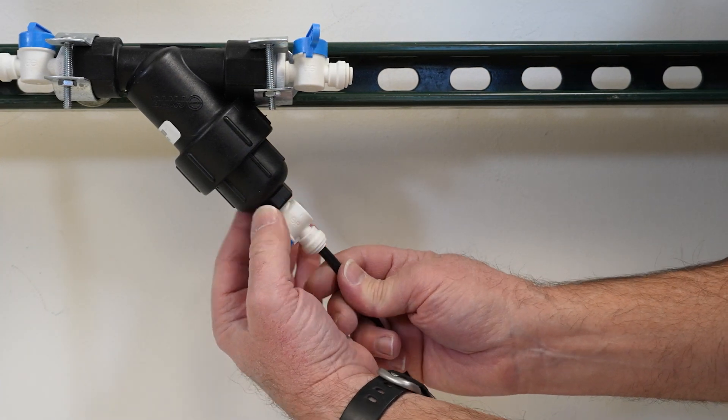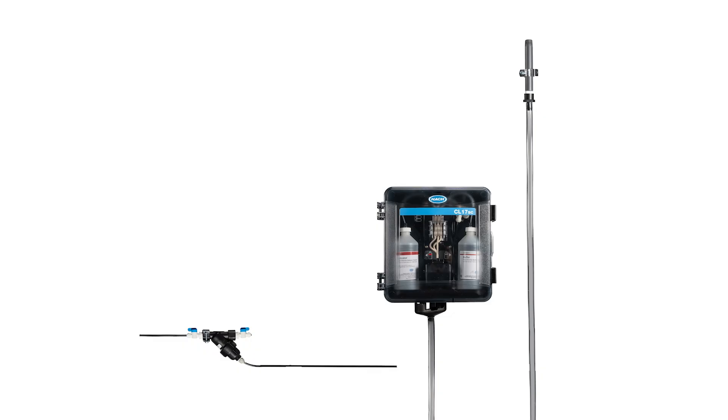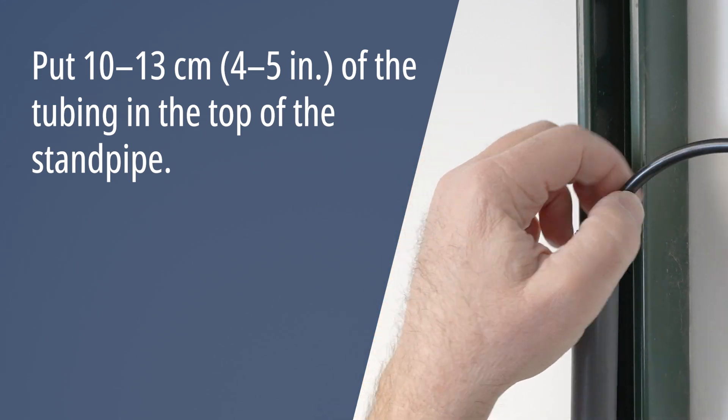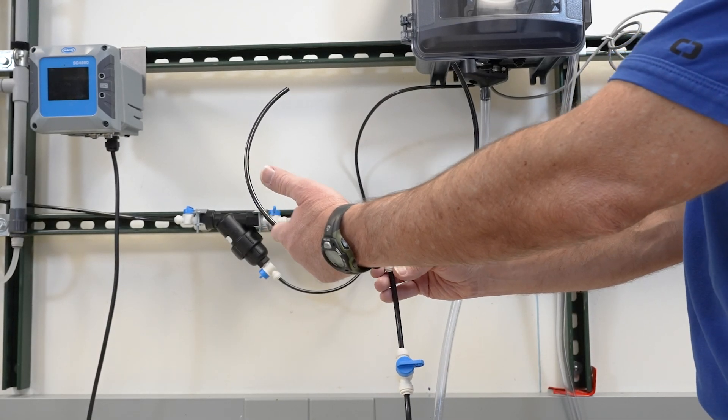Install one end of the black sample bypass tubing to the bypass port of the Y-strainer. Push the other end of the tubing behind the conduit clamp and then into the standpipe. Assemble the grab sample assembly.